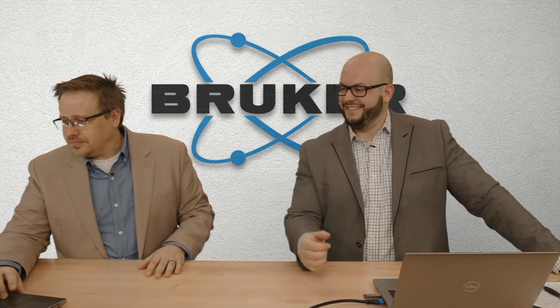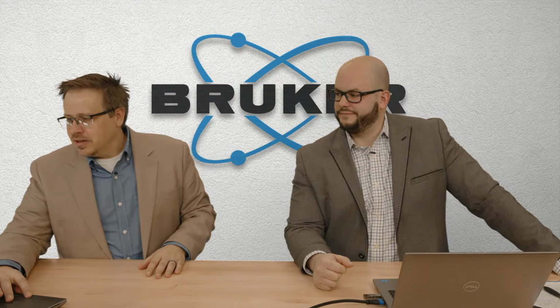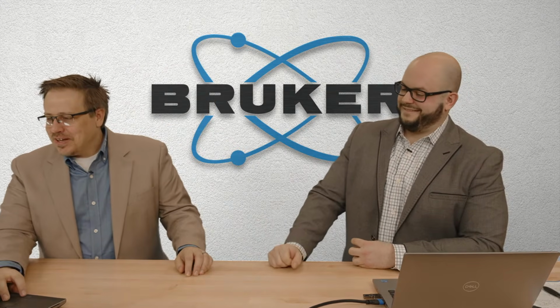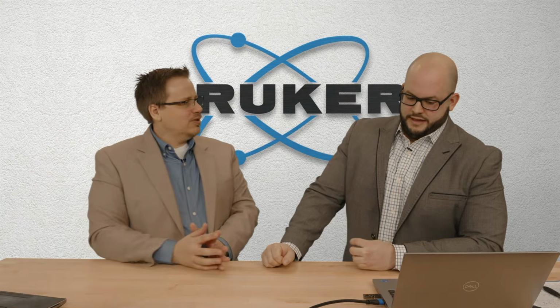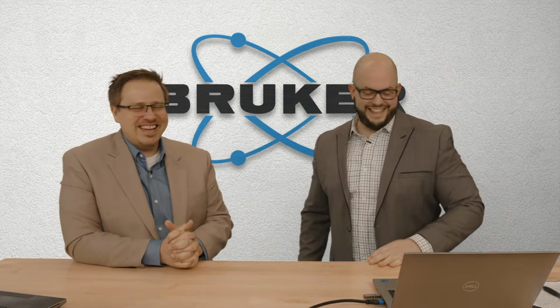All right. Another question from YouTube is from Victoria. She's one of our users actually up in Canada. Hello, Victoria. You mentioned that you can remove data points, outliers. Is this a new feature in Leptos 7.14? That's a good question. I'll defer to you on that one.